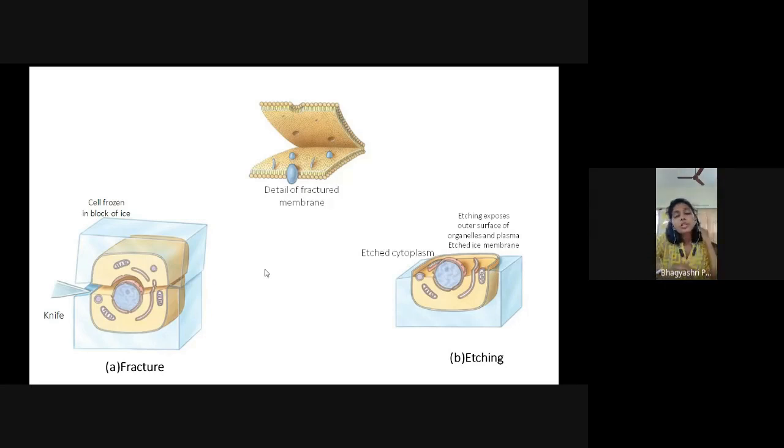So you put this etched sample on that tiny, very small copper wire grid, and that wire grid you mount under the microscope. So that through that wire grid, the electron beam will travel, will come down, will pass through the sample, and will create an image, which will be observed with the help of a lens.